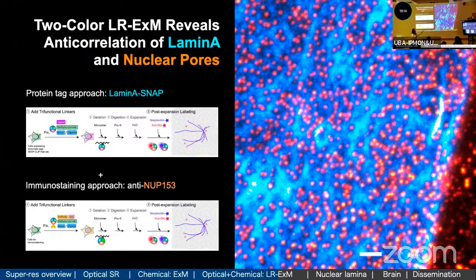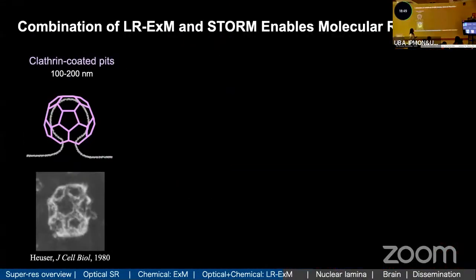Because the nuclear pore complexes are known to connect with actively transcribed DNA, and the lamina is known to regulate heterochromatin, functionally they have opposite functions, and structurally they're arranged, by our cells being intelligent enough, to avoid each other, so their functions and structures are correlated.